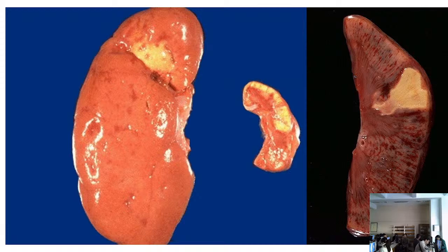Yes, please. The first part would be someone with cancer. Yes, if the patient has cancer, thrombi may develop and they may block mainly veins. Mainly veins. Here we have an arterial thrombus. Think where it may have come from. Think, where may it have come from? Yes, please.